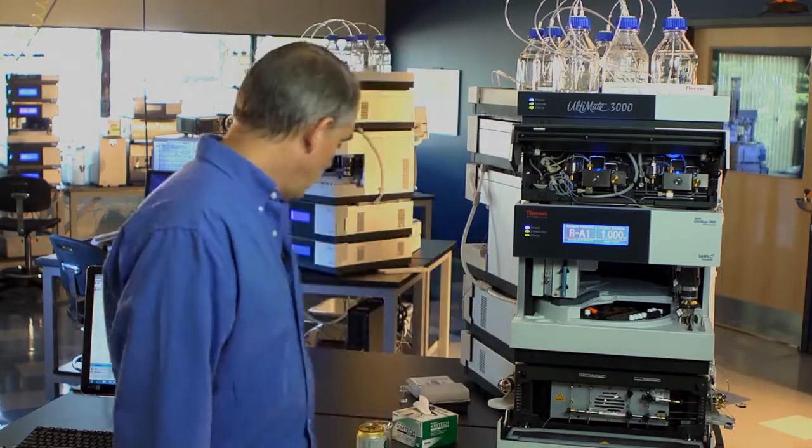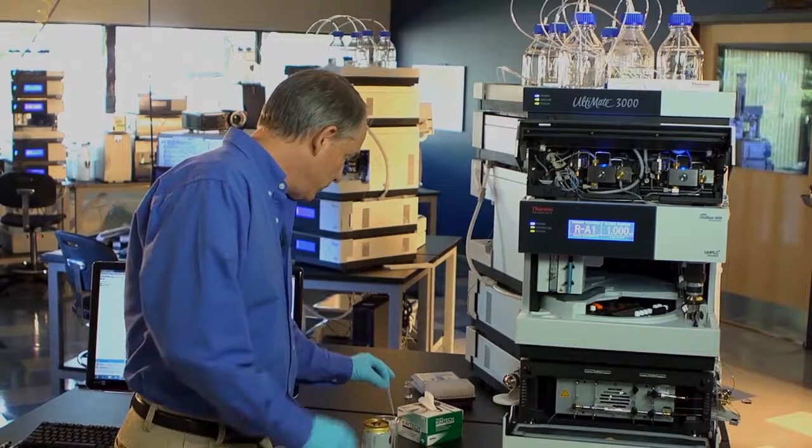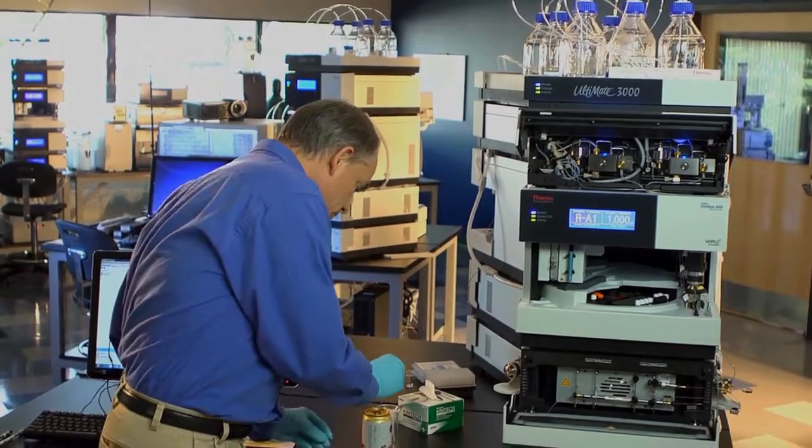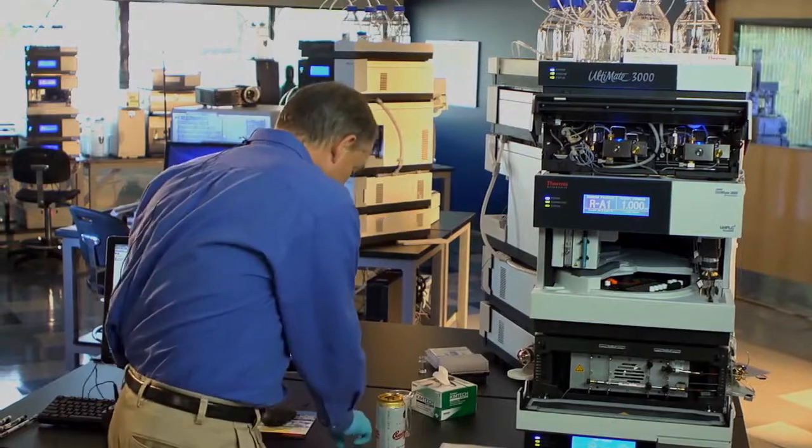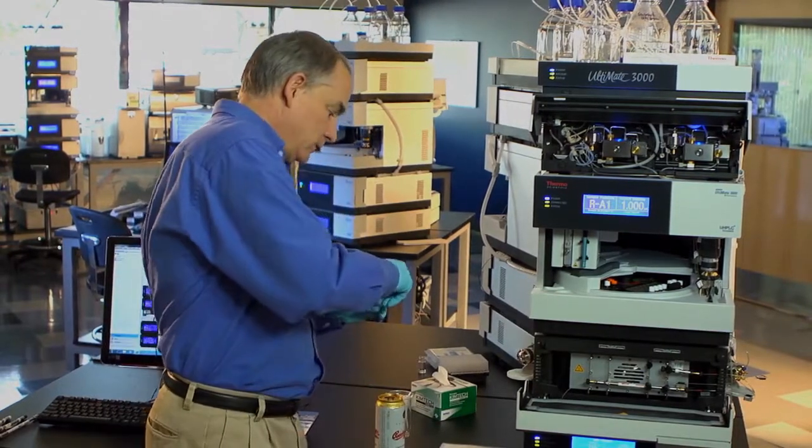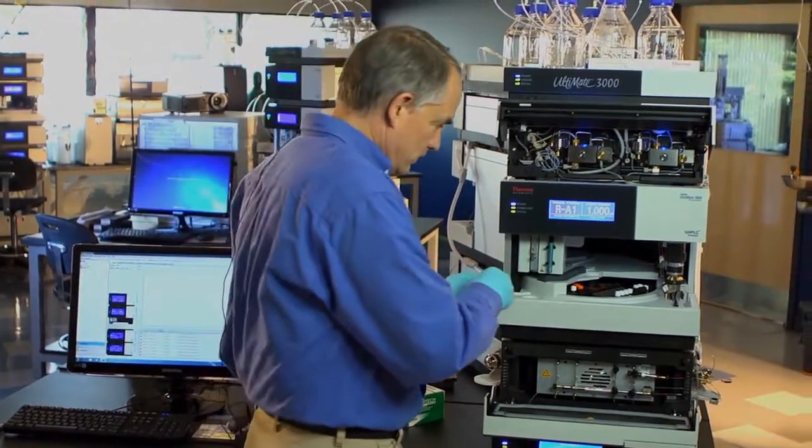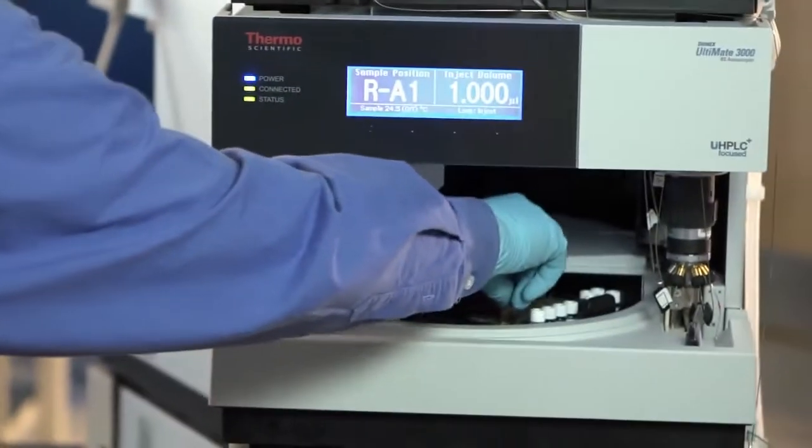Let's look now at how easy it is to analyze a beer sample using this method. Really all we have to do is take the beer, put it into the auto sampler vial, then into the auto sampler and now it's ready to run.